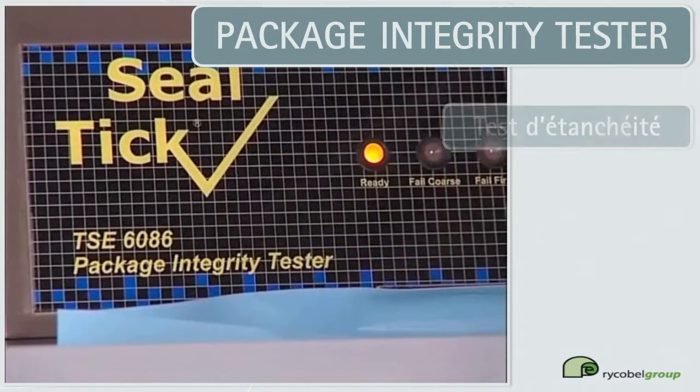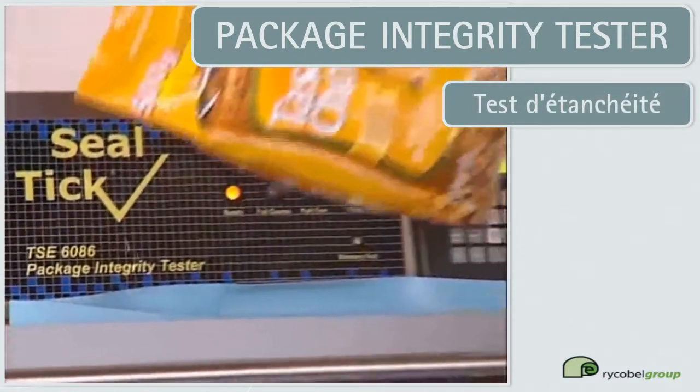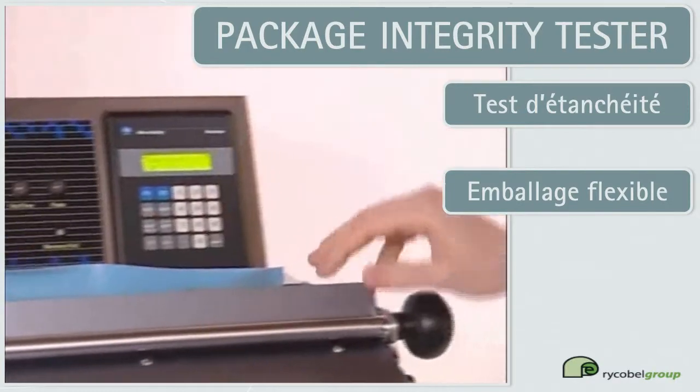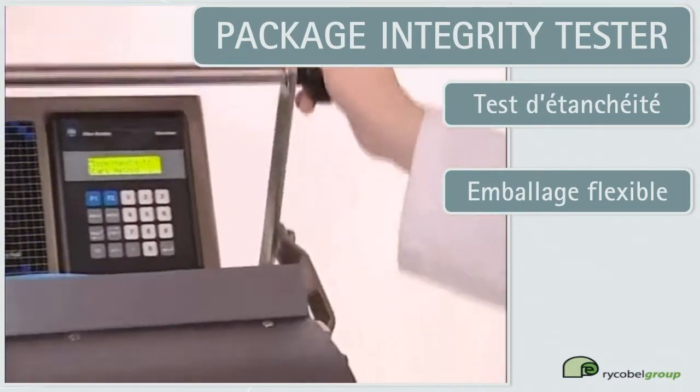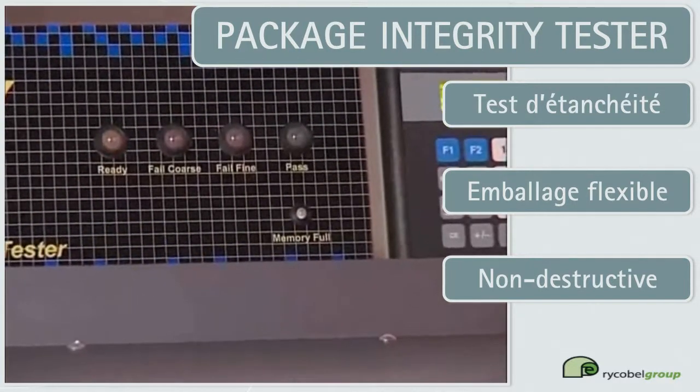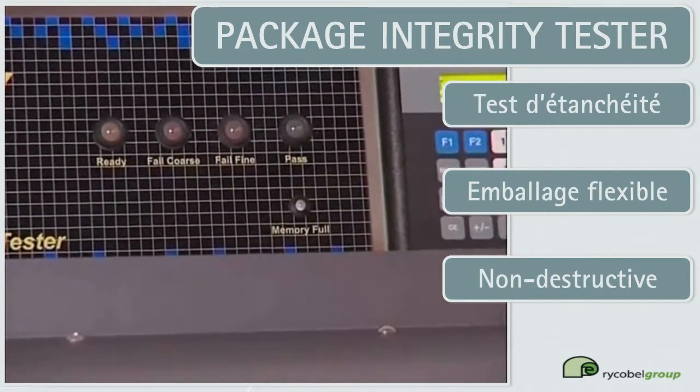The TSE 6086 avoids the complications of placing packs into a water bath and the issues of potential contamination that might arise from an uncontrolled source. It measures any leakage quantitatively, removing the operator's subjectivity.